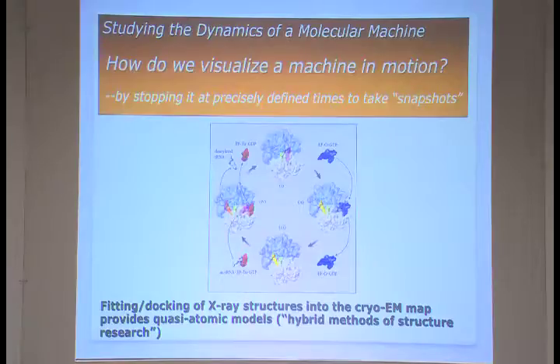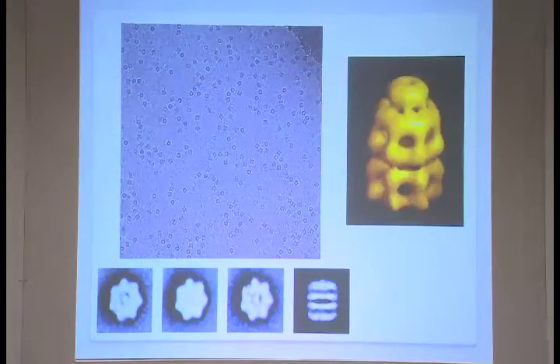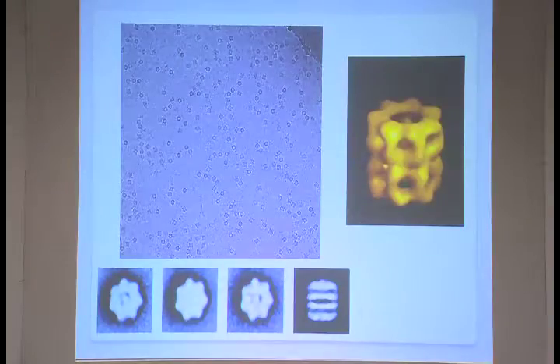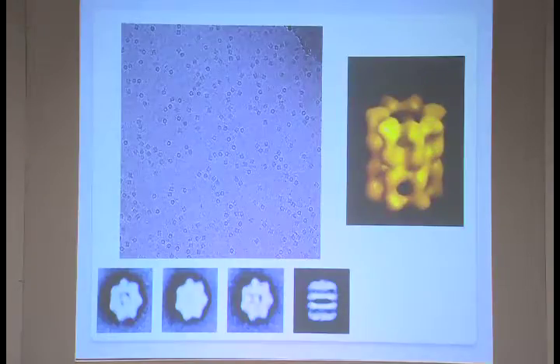So there are actually bigger motions of the whole ribosome, or it is true for any other, say, GroEL, which has a GroES-bound form, and then a protein-bound form, different forms, and it really changes conformation.